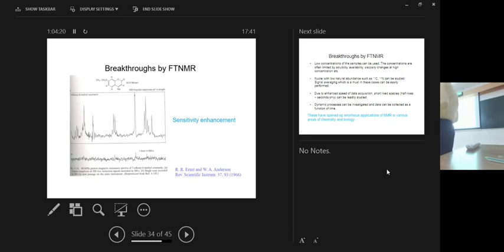When this paper was submitted to Journal of Chemical Physics, it was rejected. It was submitted to how many places, I don't know, at least 3 places he submitted, and it was rejected. So finally, it got accepted because you see, this is the CW spectrum. It's a slow passage spectrum. The slow passage spectrum of this molecule looks like this, recorded in 500 seconds. One scanning through this in 500 seconds produced a signal which looks like this.